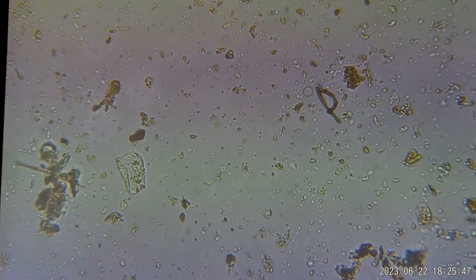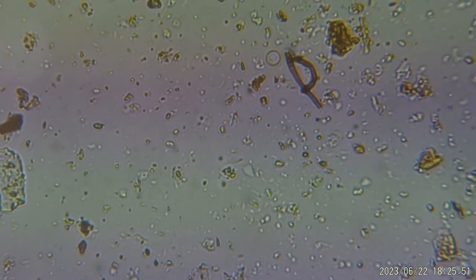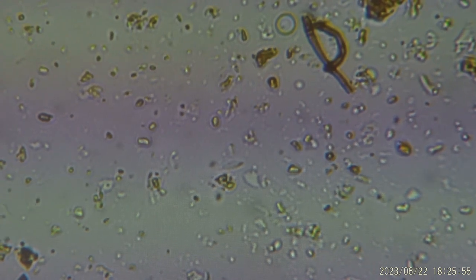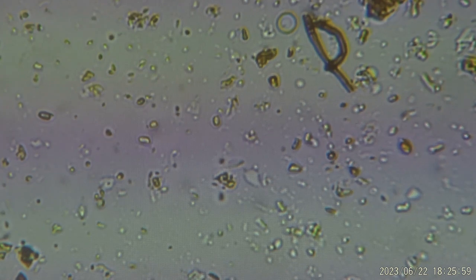But soil food web does not count that. It makes an observation of it. But that observation is important, because if the microbes are cysting, that's an indicator that you need to change the conditions in your soil to create the environment for them. Is that a fungal hyphae to the right of it?